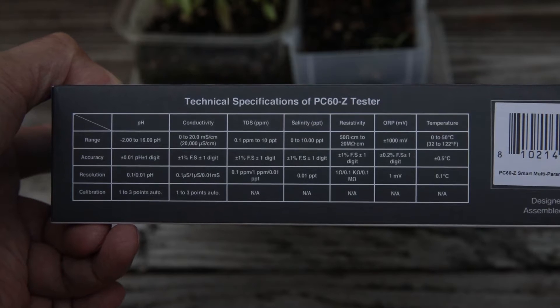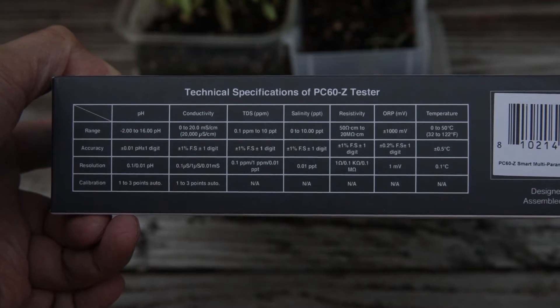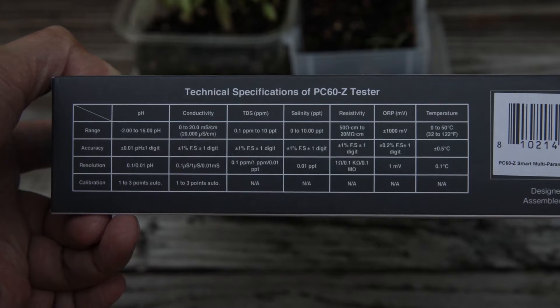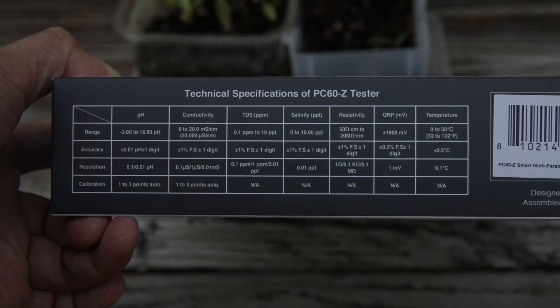You also see the range, accuracy, resolution, and calibration specifications for pH, conductivity, TDS, salinity, resistivity, ORP, and temperature.